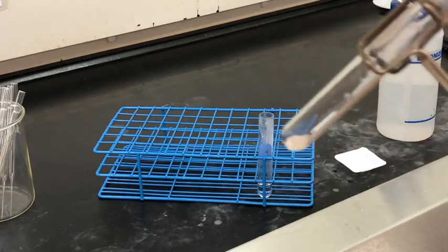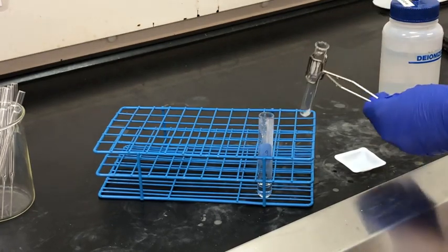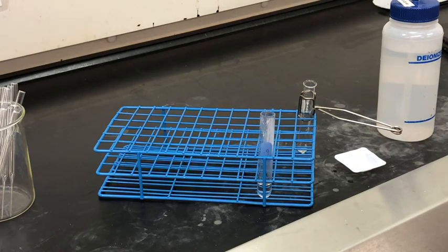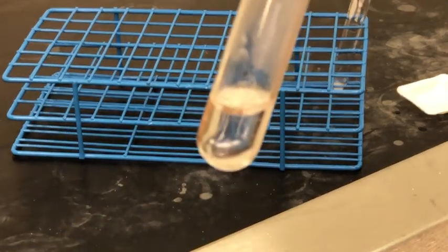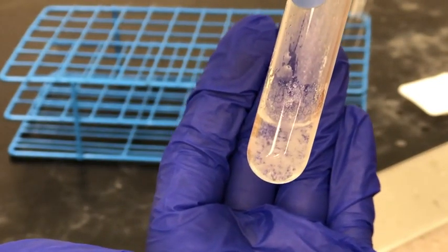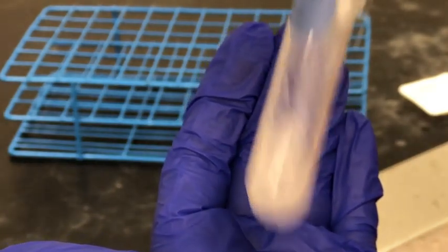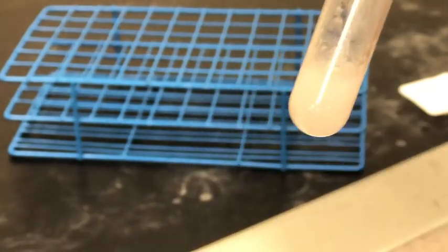There might also be some liquid left in the bottom of the test tube — that's okay, though this might be another place where we lose a little of the desired product. Now we're going to let the solution cool and we should start to see some crystals form. If we agitate it you can see crystals forming, and if we reference our flowchart in our lab manual, what do you think those crystals are?